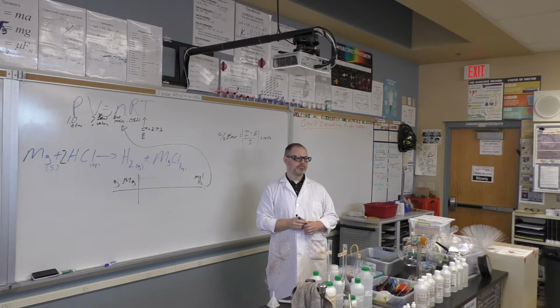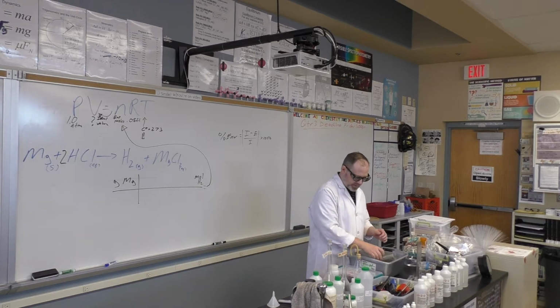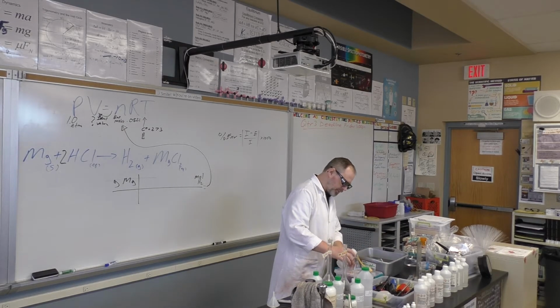Want to see it happen? Okay, digest that while the magic happens. Once again, I'm going to try to do this single-handedly. It's not easy. You're just going to fill up your Erlenmeyer flask to 125 milliliters.